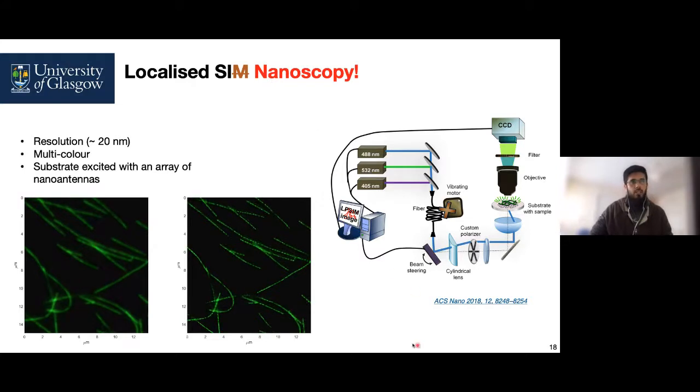So in this paper, the authors demonstrated a resolution up to 20 nanometers. And what they propose is, based on the way they illuminate the patterns, they can go to molecular levels, which is about 5 nanometers resolution. So these are two very interesting areas that are recently developing.